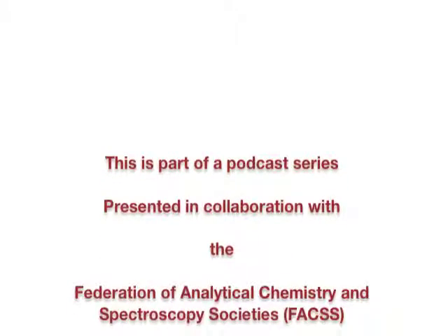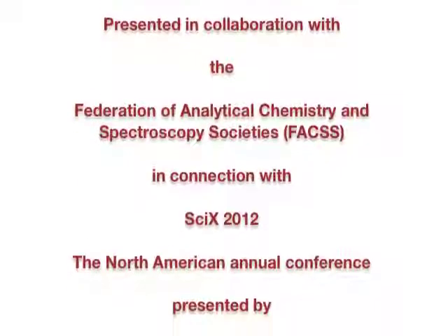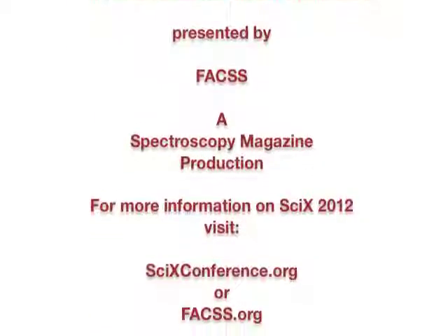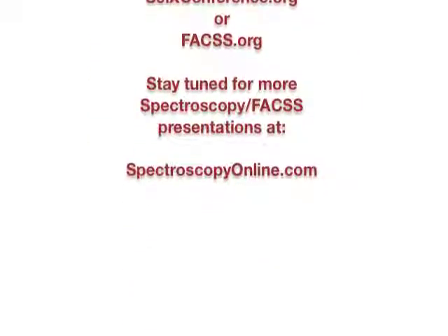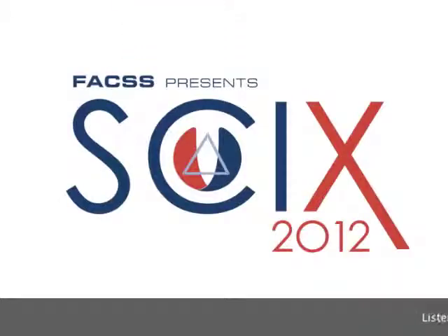to access. But since it's a relatively new area, we've only been doing this, when I say new, we've been doing this for about 10 years now. But a lot remains to be explored yet, including just how many elements can be tackled and what the potential problems might be when we start looking at real systems and considering interferences from other concomitants in the sample. Those are questions that have yet to be addressed.